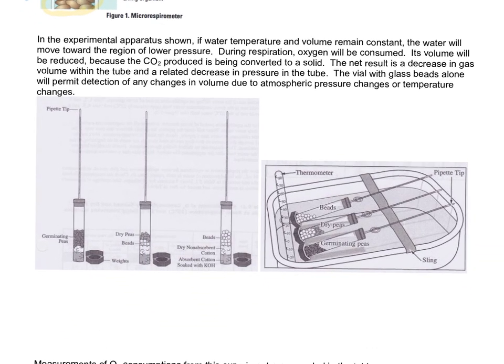The way that the experiment is set up is that it is kept in a water bath. In general, water just doesn't change temperature very easily compared to the air. So by putting these vials into water, it just helps to regulate the temperature. The long pipette is where the water droplet is, so that dyed red water droplet is put at the tip of each of the pipettes.